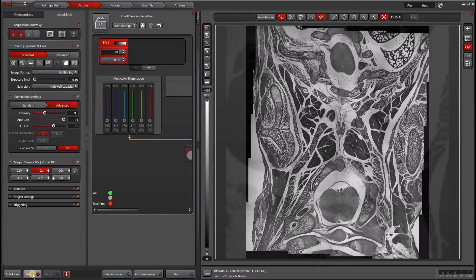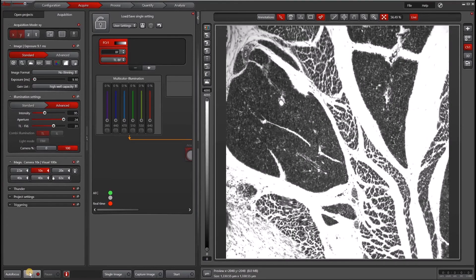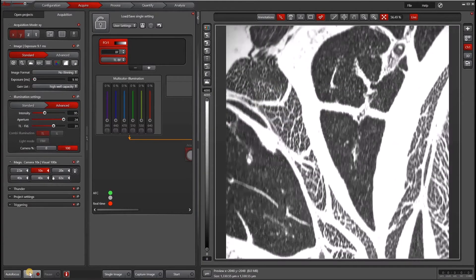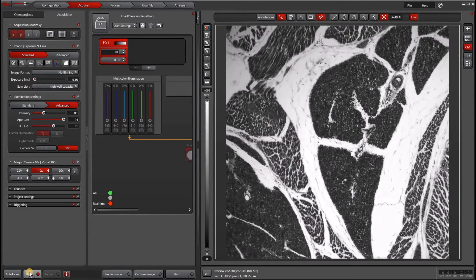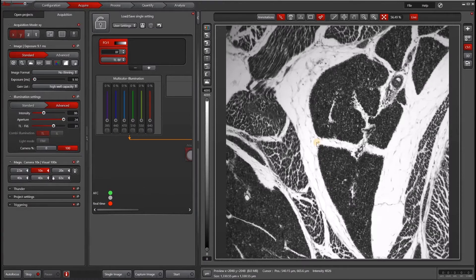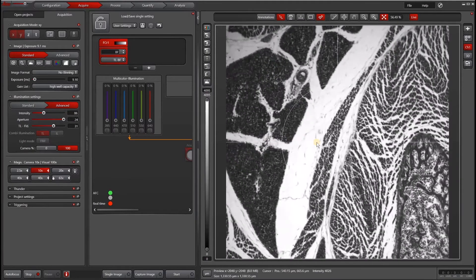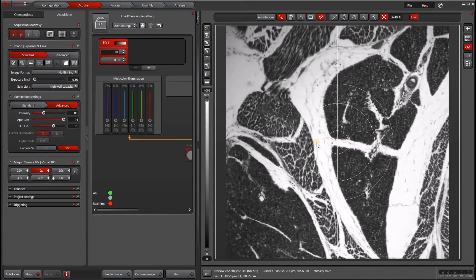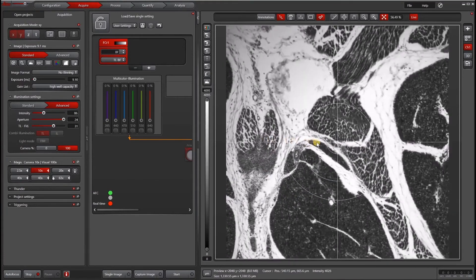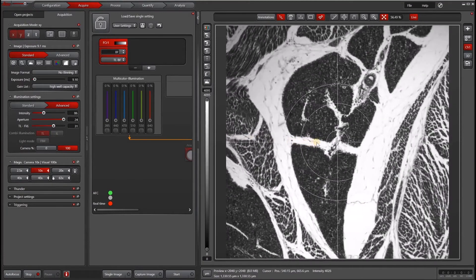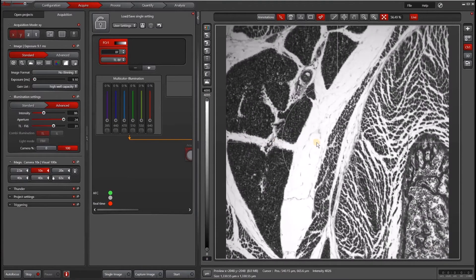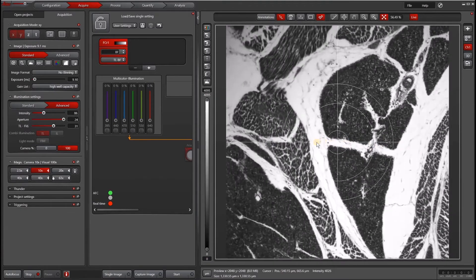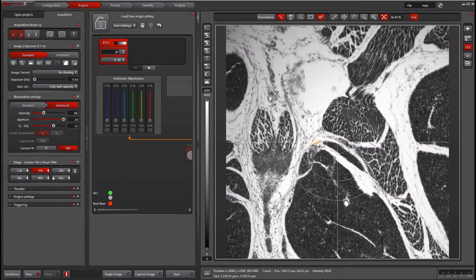Now let's go live. What we want to do is find a little speck that is easy to follow. For our purposes, I will choose to follow this little speck right here. We can hit Ctrl+T and then use the joystick or smart move to move it left to right like this. You can see that the dot is moving off the axis by a certain predictable way.